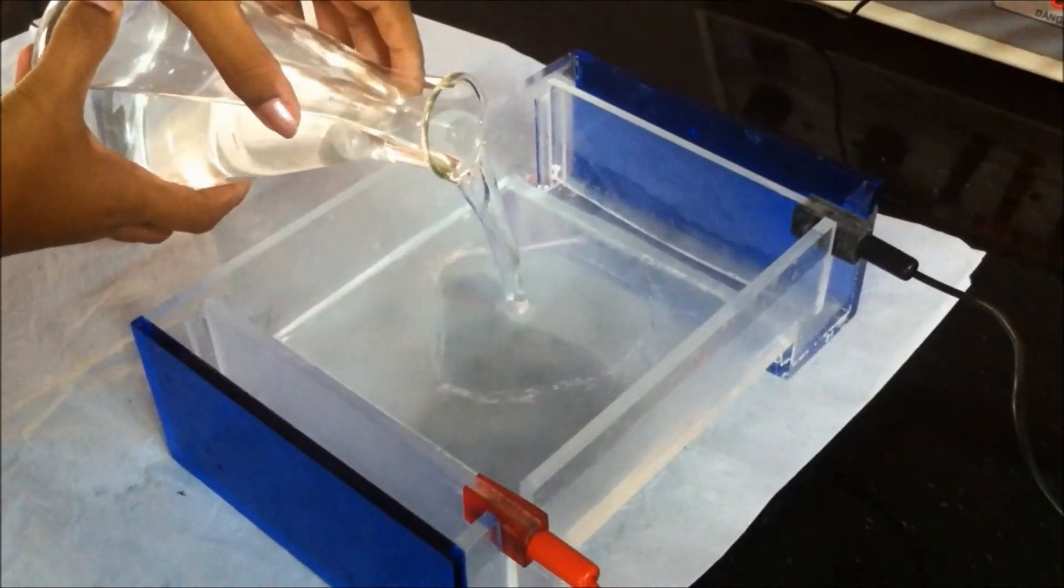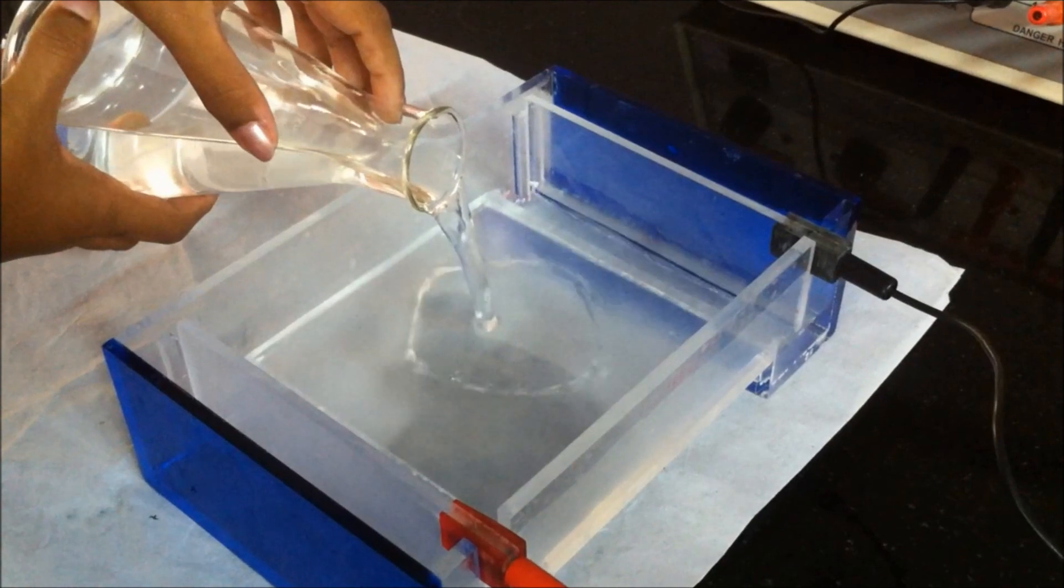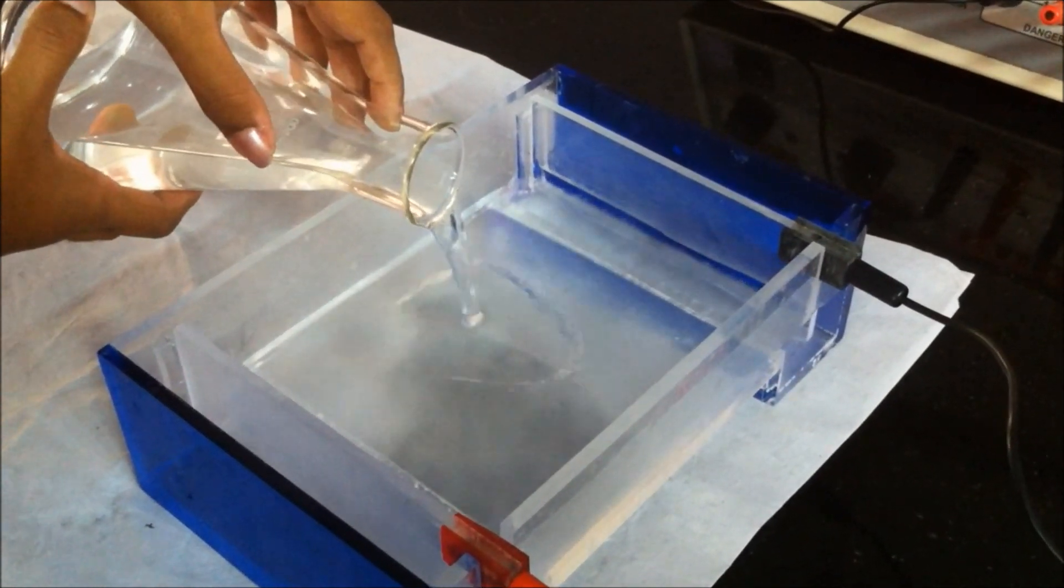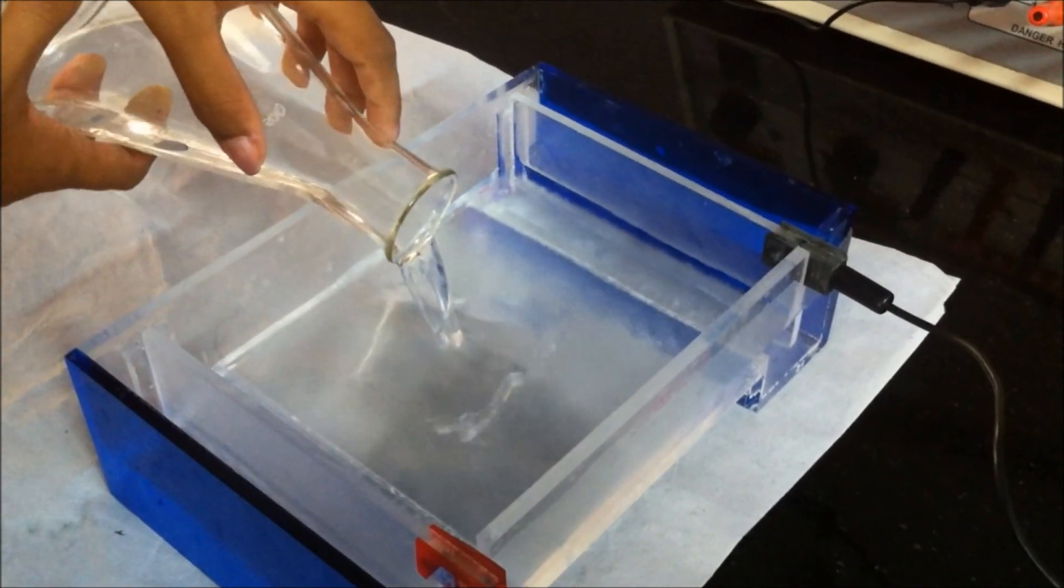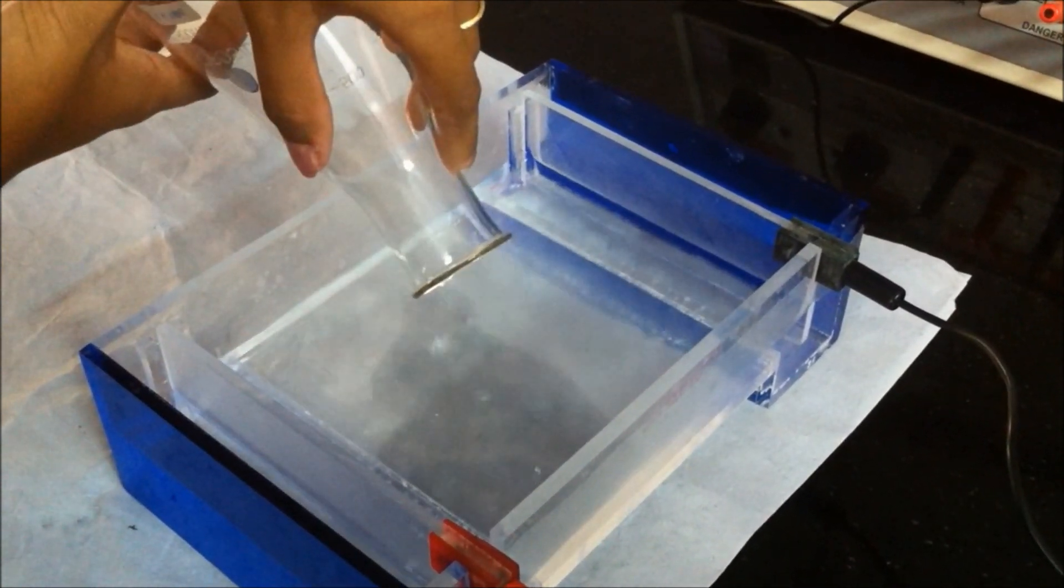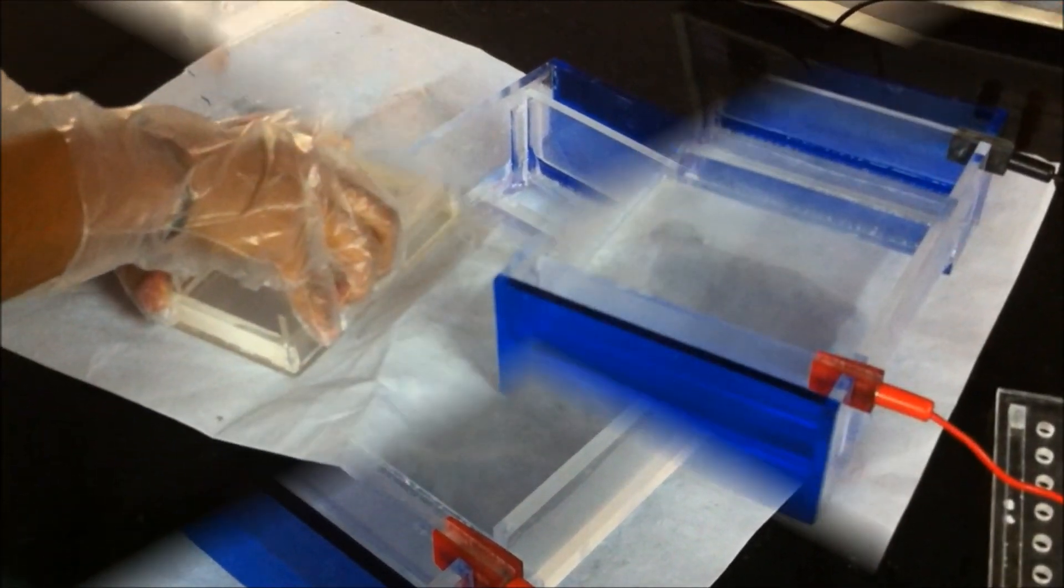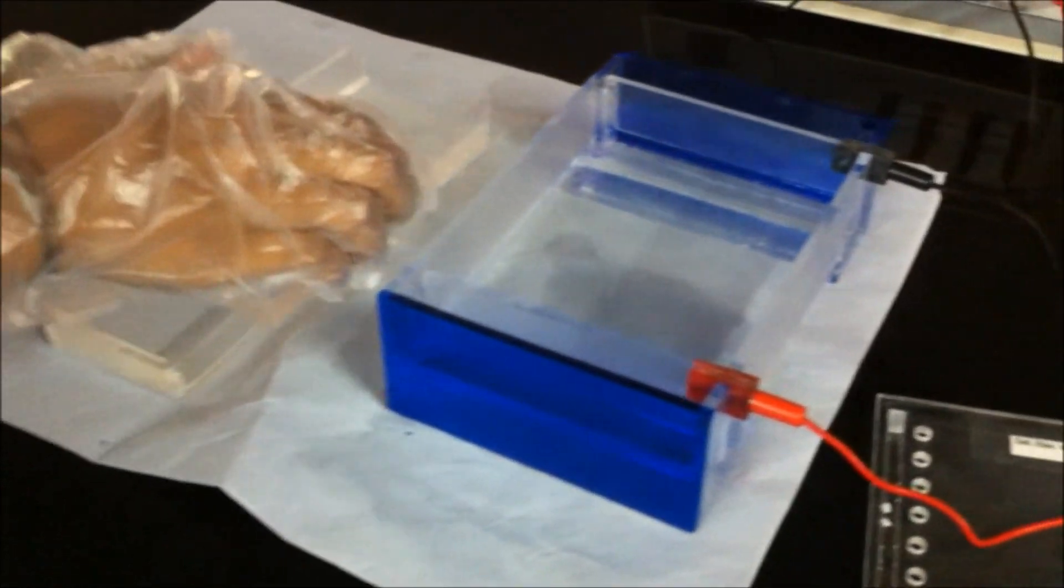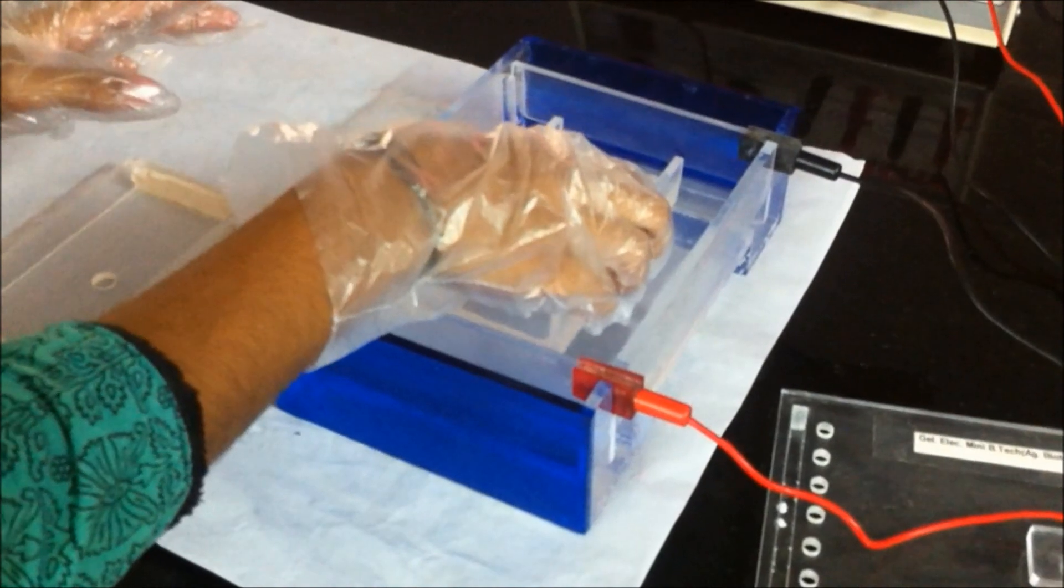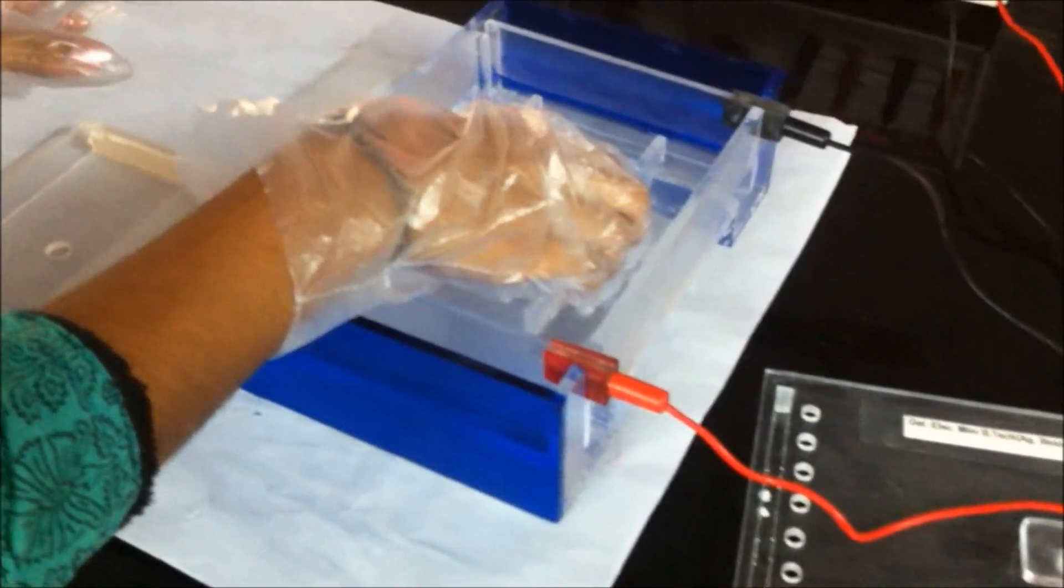Prepare 1X TBE buffer and pour it into the gel tank. Carefully remove the comb and place the plate inside the gel tank.